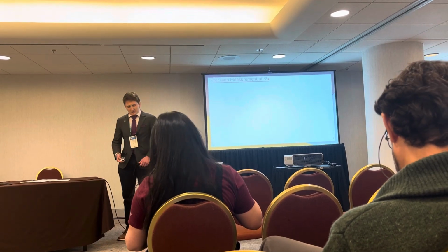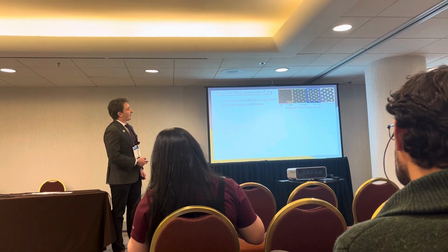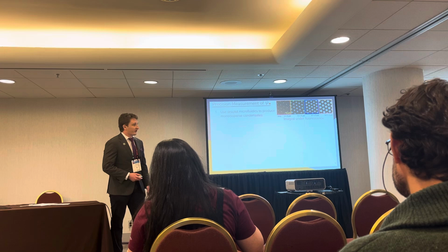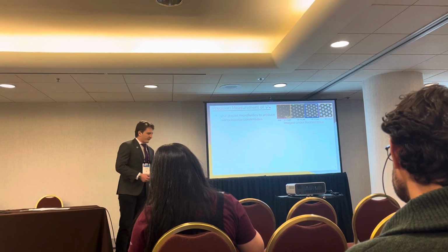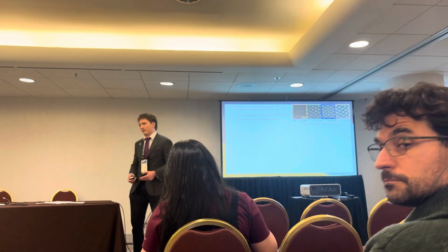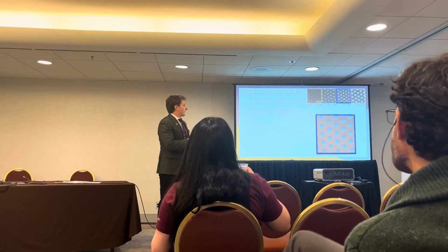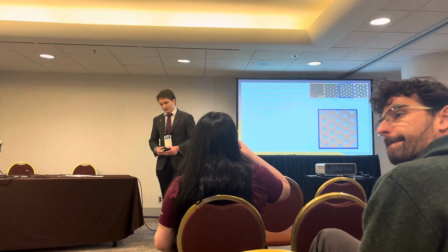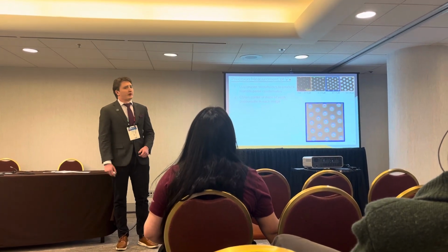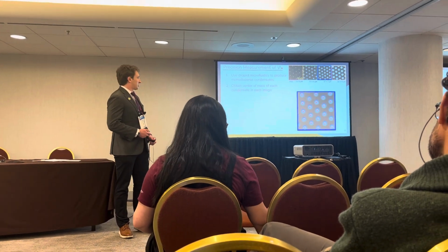So how is this a precision measurement? I've engineered and exploited droplet microfluidics, which you can see in the top right corner, to produce monodispersed condensates with respect to concentration and volume. And the overall concentrations we're typically looking at are on the order of 1 to 120 micromolar. The first thing that we would do, by the way, these are also imaged under fluorescence, which is an important detail, right? So the first thing we did is we used a machine learning program to identify the centers of mass of every condensate in every image at every temperature.